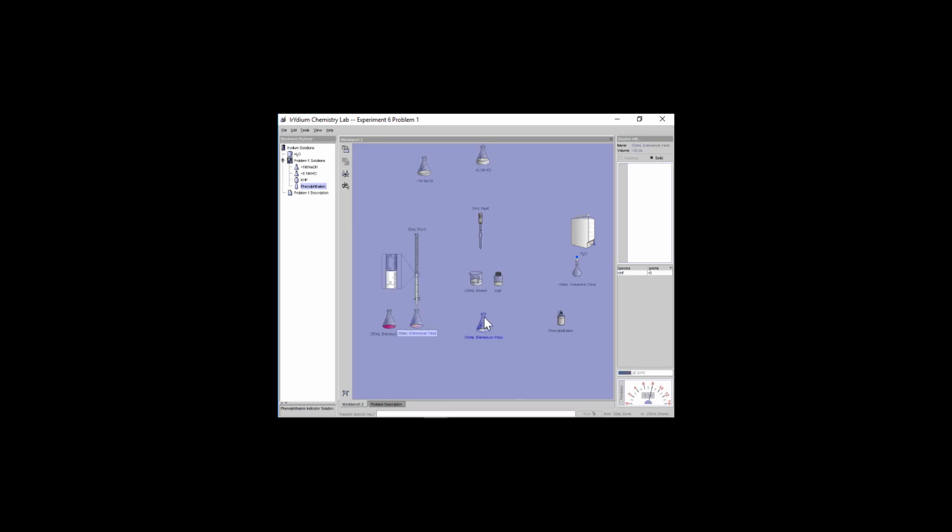You'll notice my second volume, again, I'll jot these numbers down for you later on as well, is 31.00. I'm just reading off the side of the burette what it's saying. So 31.0, I'm going to guess maybe 0.03 or so. Again, I'm going to associate an error of 0.05.